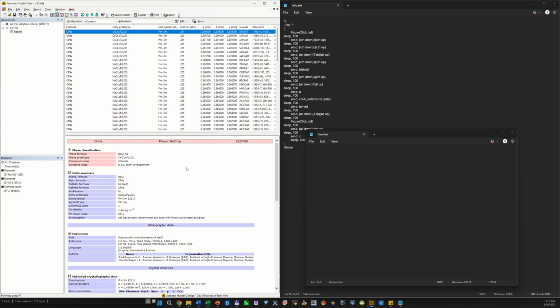Important thing, if you Alt tab to something else, any other window, since it has the delete option included here, hitting the delete button, you might find some of your files, if you're not careful, in the recycle bin. So please try to avoid it. That's why Alt tabbing a few times between the PCD and the text editor is essential.